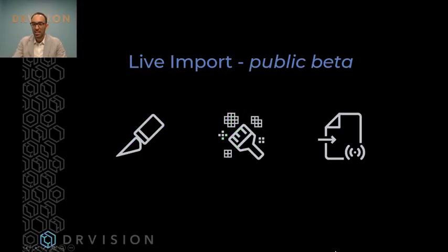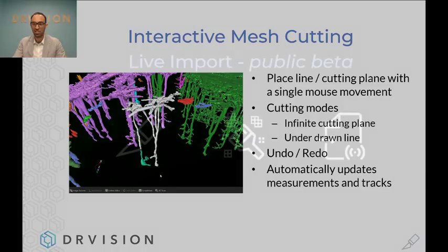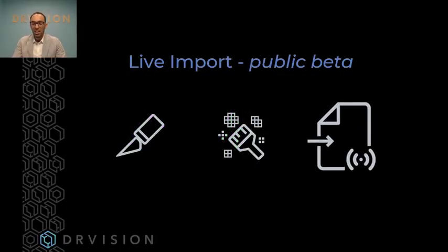Okay, and that is for the interactive mesh cutting. This very handy feature. And now we're coming to the end.